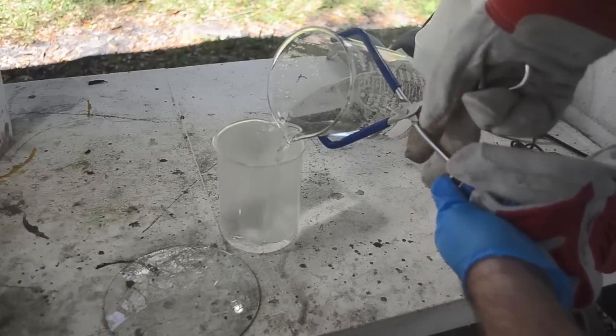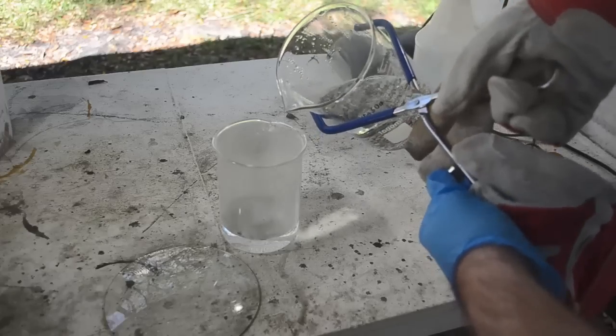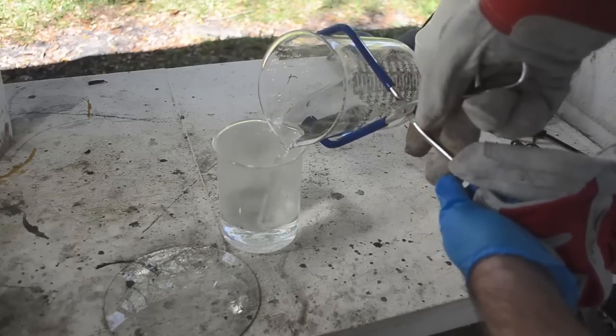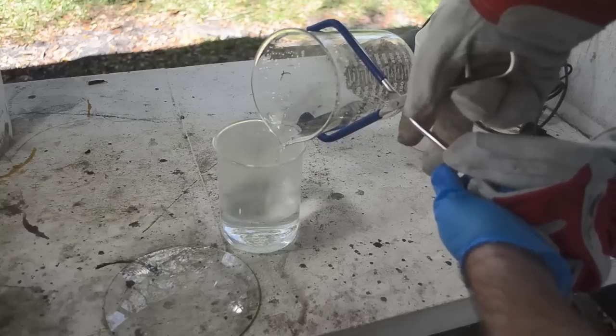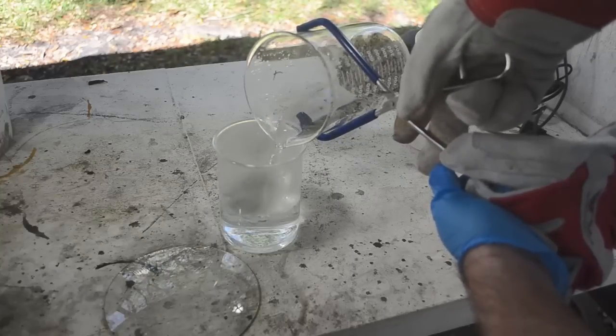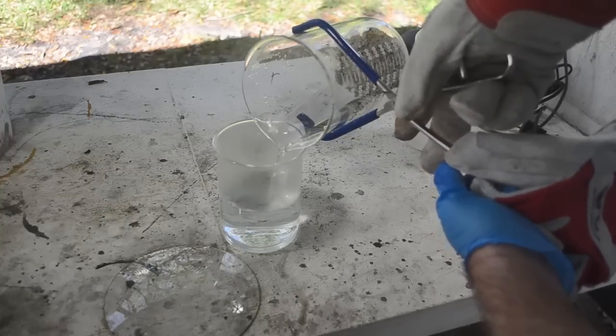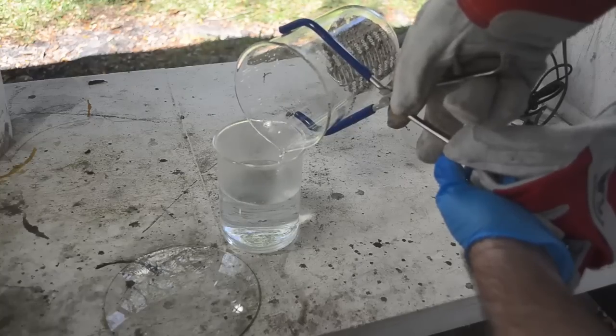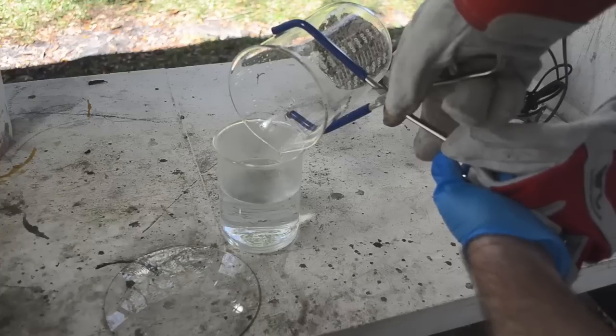Because if we have dissolved some silver and made silver sulfate, it will come out as solution as soon as this stuff cools down. And I don't want to contaminate the silver with the silver sulfate. But I want to test the liquid to see if it does have any silver sulfate in it.